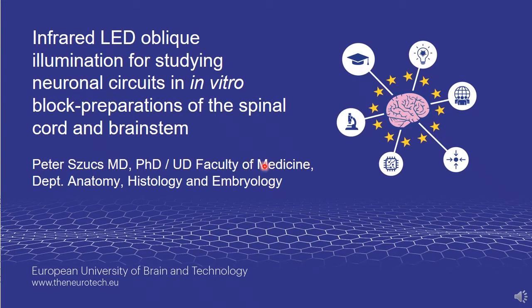Welcome to the series Current Methods in Neurotechnology. This short presentation is about how infrared LED oblique illumination can be utilized to study neuronal circuits in the intact spinal cord, block and brainstem preparations.